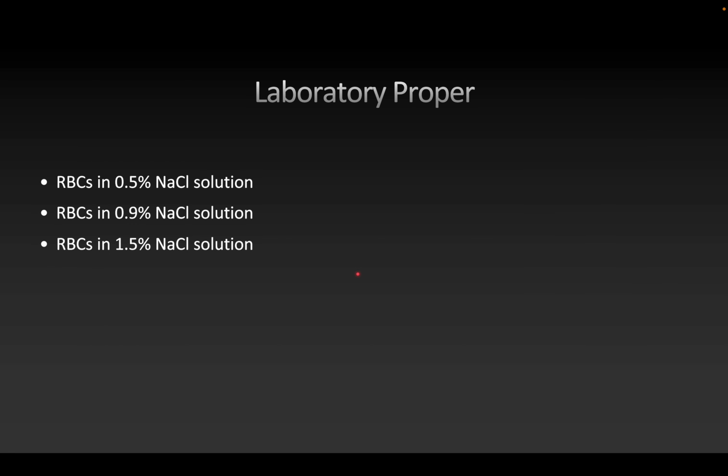For your laboratory proper, if we are going to have an on-site class tomorrow, I'm hoping this time we read through the instructions and follow them as faithfully as possible. During our last meeting, you extracted some blood from your classmates and observed the blood cells under the microscope. This time, we will be subjecting those blood cells to different concentrations of NaCl solutions.